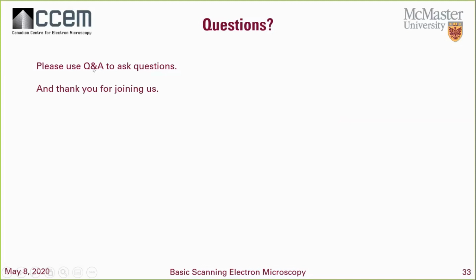First question: to do electron lithography, do we need a dedicated SEM, or can any conventional SEM be used? The big problem with doing EBL is that you have to have a system that allows you the resolution that you want. So you have to have things like a field emission microscope, unless you're doing things on the micron size scale. If you want to do nanometer resolution, you have to have a very high-end field emission microscope in order to get a small beam size.